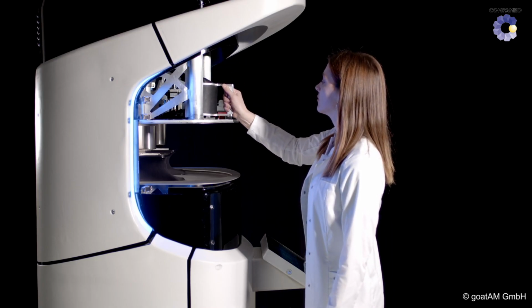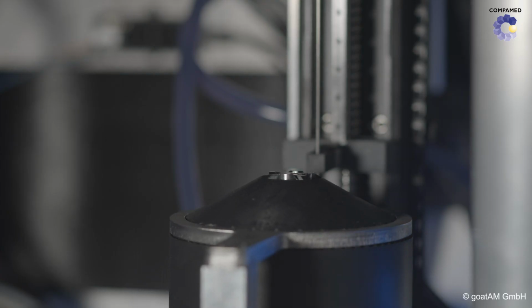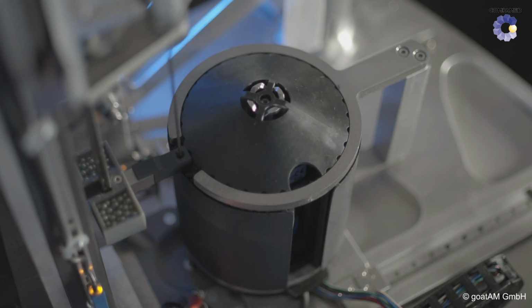Tilman Spitz, who has now co-founded the pilot project as the startup company goatAM, sees many possible areas of application for the 3D printer. If we are only talking about oral dosage forms, then it would be strongly integrated into the daily routine of hospitals and their pharmacies. In university hospitals, it would mainly be used in drug trials because you can produce these small quantities without having to start up a complete production line, which is a huge cost factor.